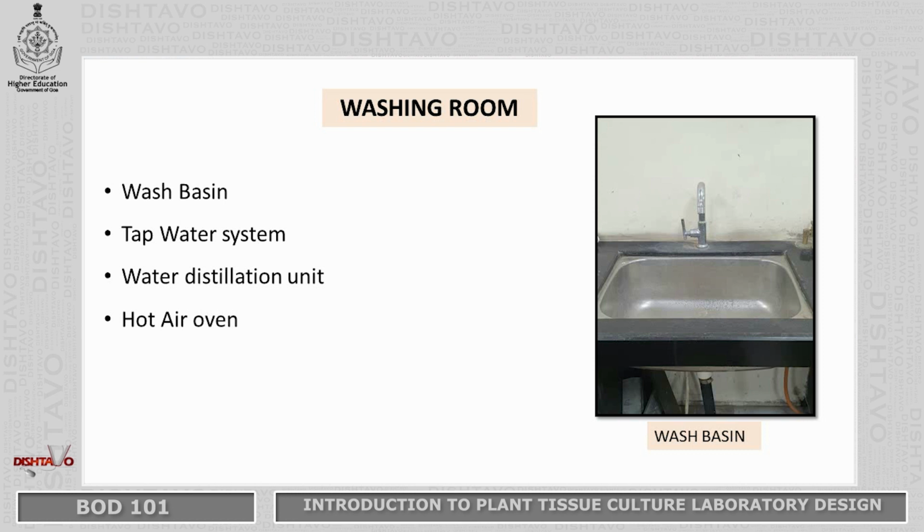Care in this room should be taken that solid media which is used for culturing should be discarded immediately. The contaminated media should be decontaminated first using an autoclave and then kept for washing.